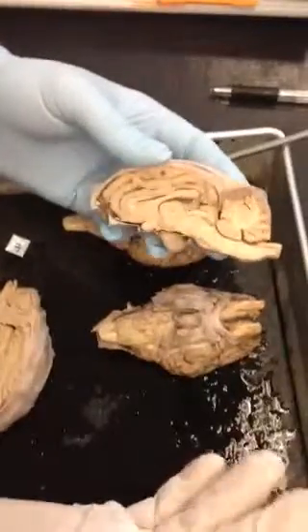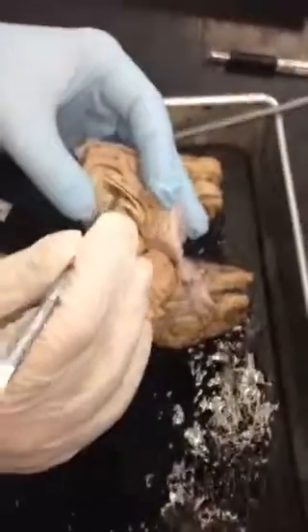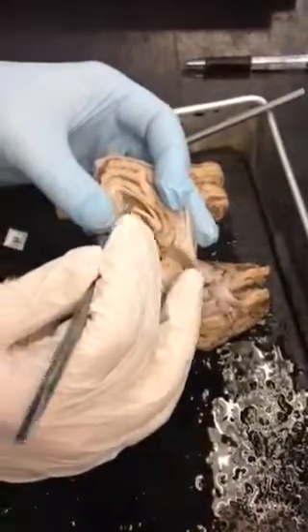And then the choroid plexus is the capillaries on the inside. So that's some choroid plexus right there. And that's where the CSF is made, right? Yes. That's where it's produced.